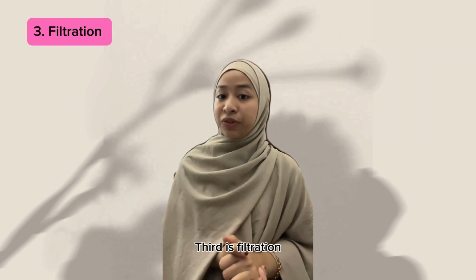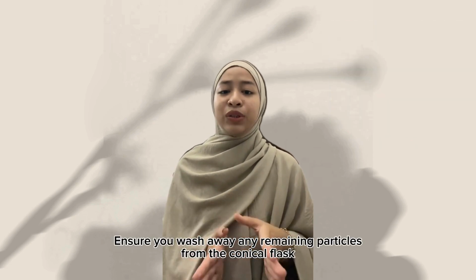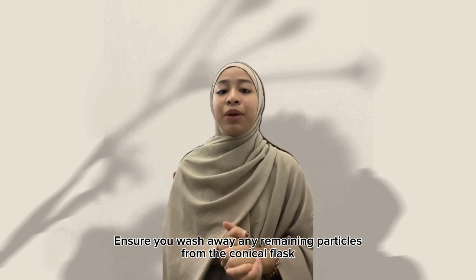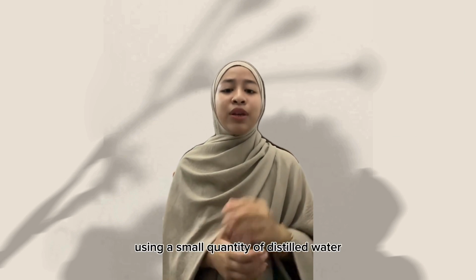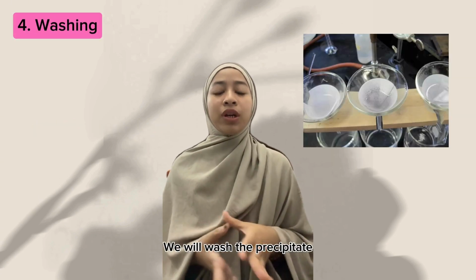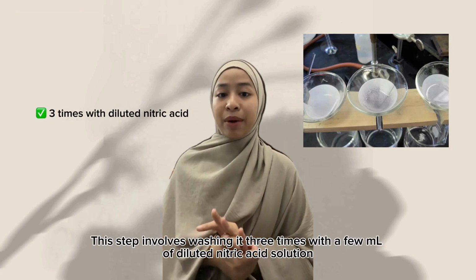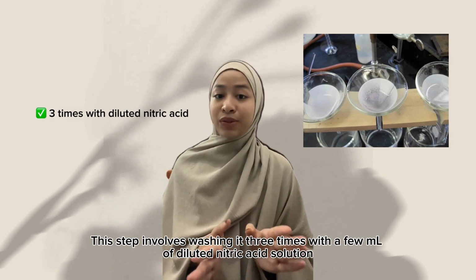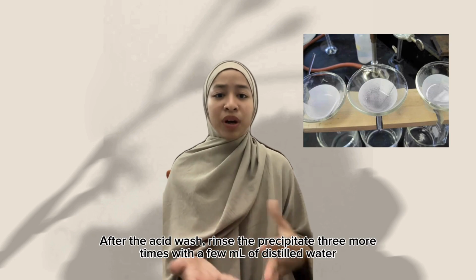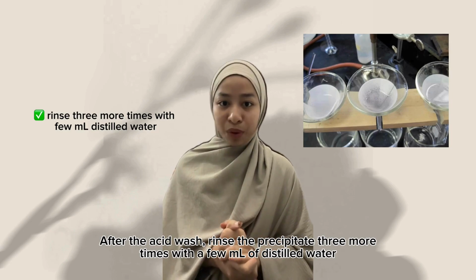Third is filtration. Transfer the precipitate to the Buchner funnel. Ensure you wash away any remaining particles from the conical flask using a small quantity of distilled water. Fourth is washing. We will wash the precipitate. This step involves washing it 3 times with a few ml of diluted nitric acid solution. After the acid wash, rinse the precipitate 3 more times with a few ml of distilled water.